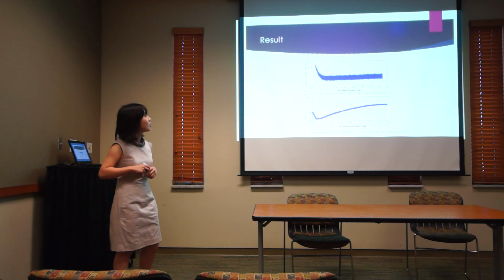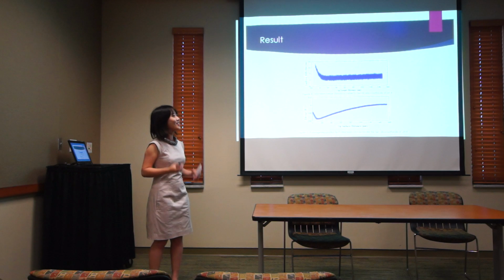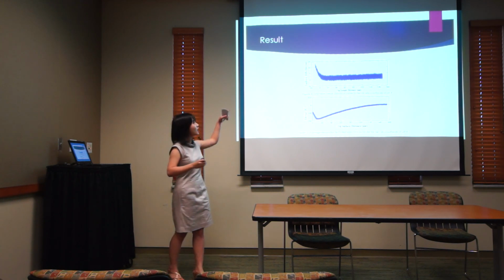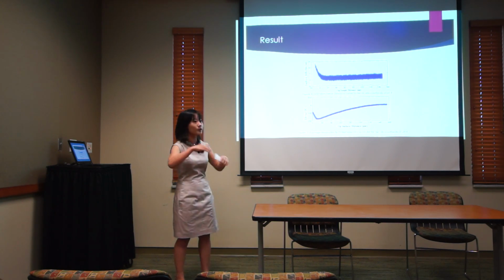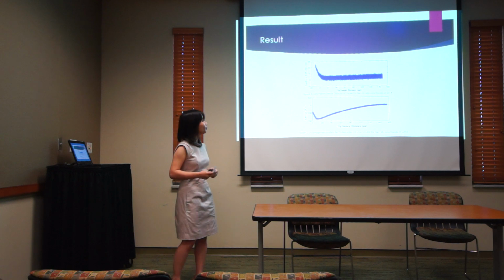So here are our results. This is a force curve at a silica surface at pH 4. The top one is what we have from the atomic force microscope, and it gives us the cantilever deflection versus the tip-sample distance. And on the bottom is our intermolecular potential profile.